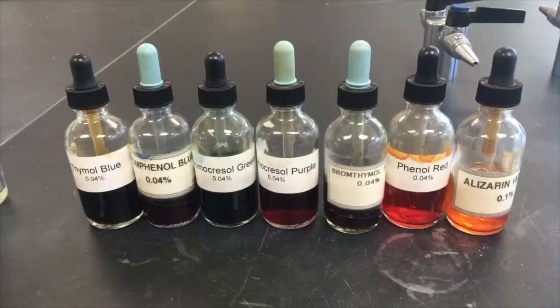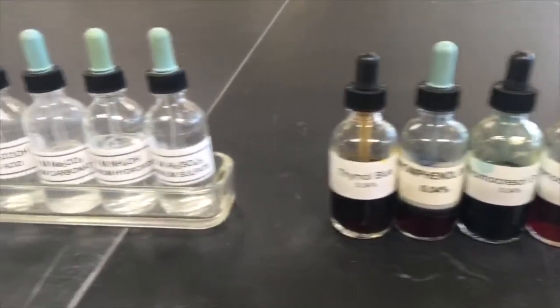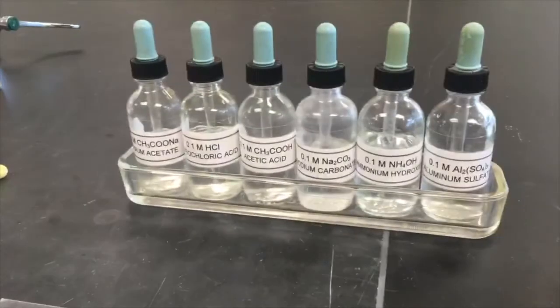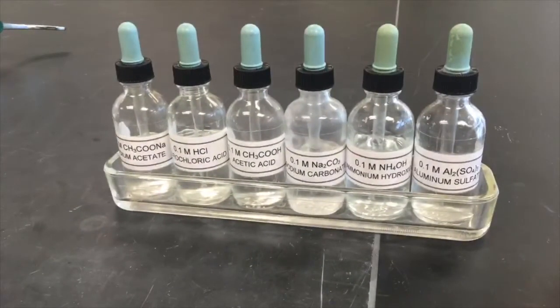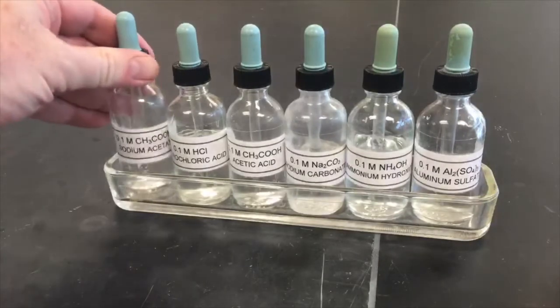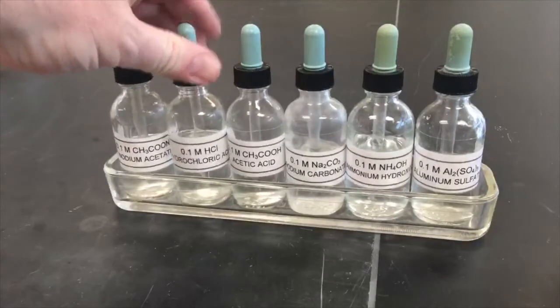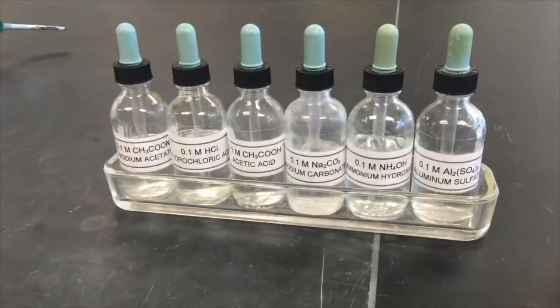Over here, we'll just move over a little bit. Here are the known solutions that will be measuring the pH of using the indicator. So we have some sodium acetate and hydrochloric acid and you'll see all those as we go along.